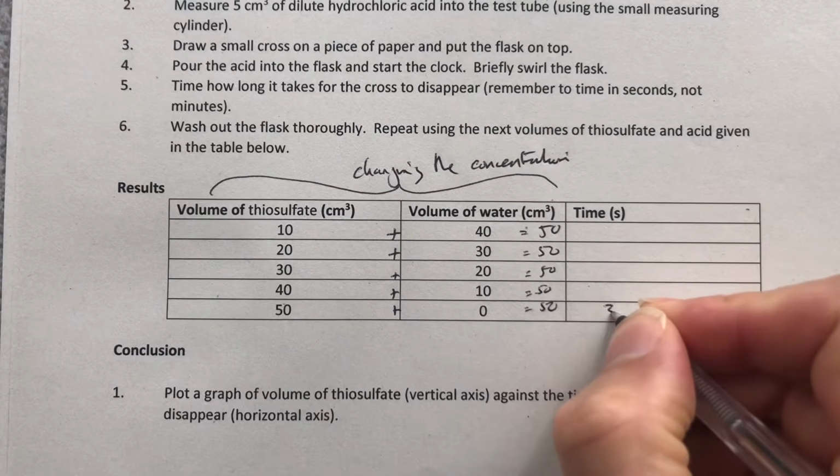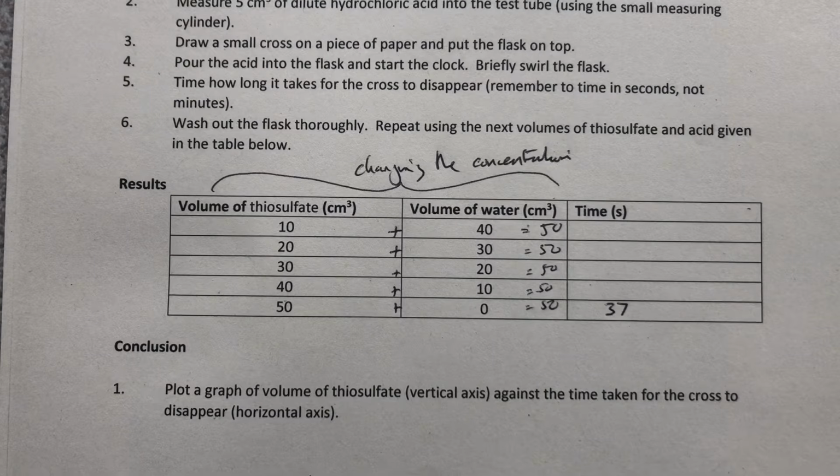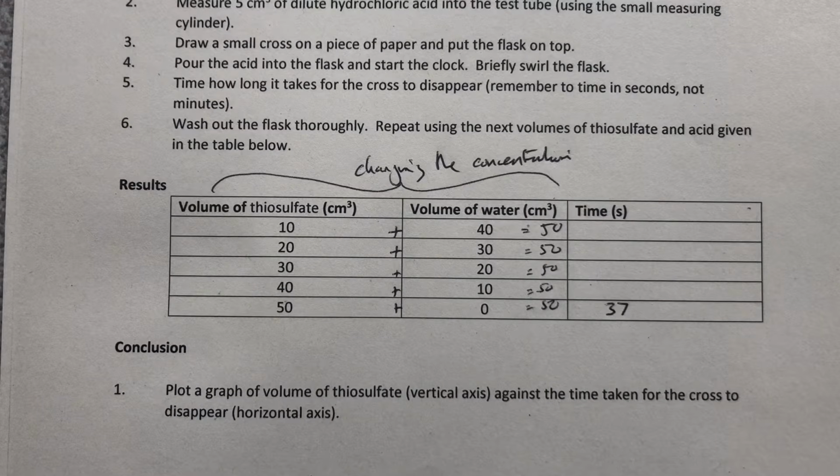That was 37 seconds. Now if I'm going to do this experiment accurately, then it will be entirely reasonable to repeat that experiment a couple of times and then average the results. Because there is obviously a margin of error, deciding when the cross can be seen or can't be seen, and when you start the watch, maybe how much you shake it and whatever else.